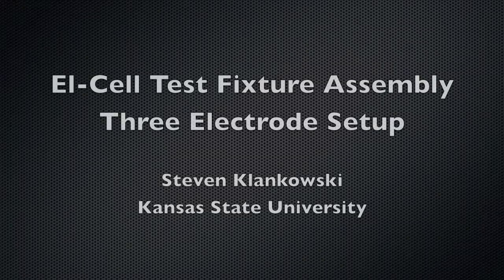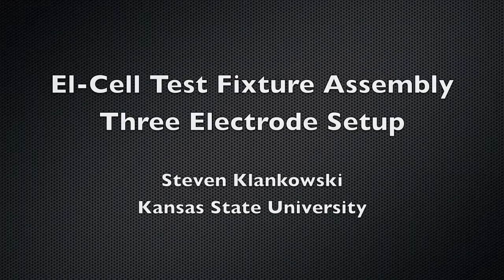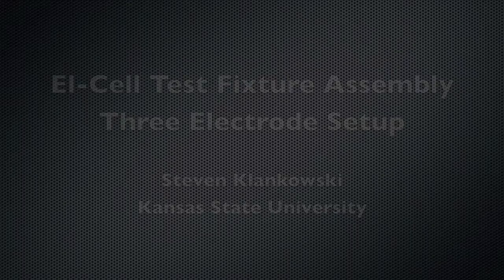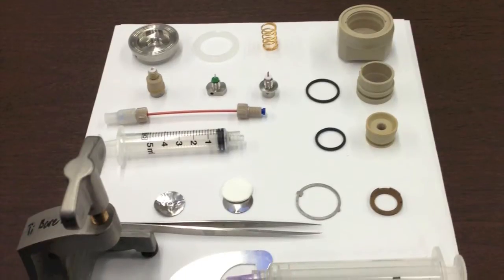Good day. My name is Steve Klenkowski. I'm a graduate student at Kansas State University and I'm here to demonstrate the assembly of an L-Cell 3 electrode setup battery test unit.